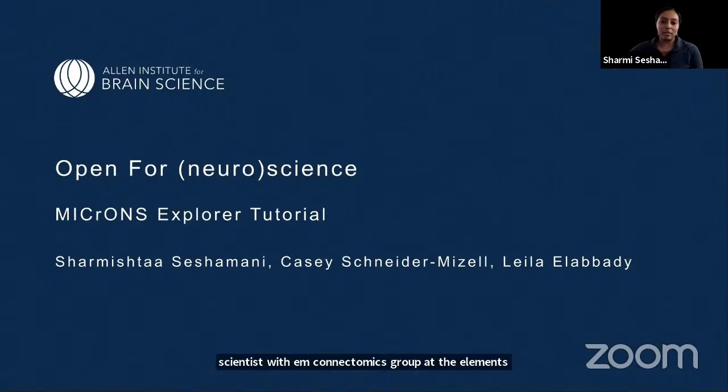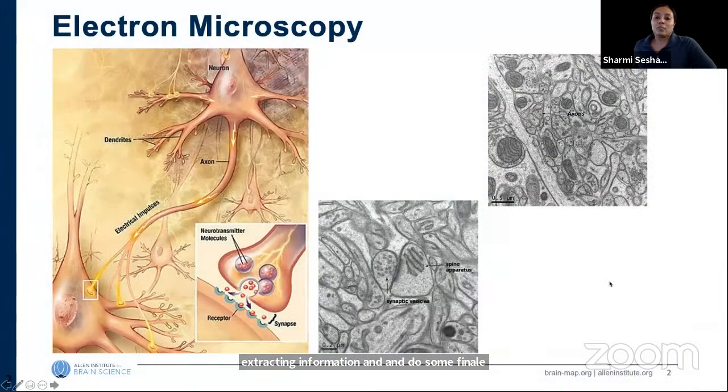Today I'm presenting with my colleagues Casey and Layla to show you the MICrONS dataset that we released last year and show you some of the tools for interacting with the data and extracting information and do some fun analysis with it. First, I'll start with a quick recap of electron microscopy for anyone who may have missed the symposium earlier today.